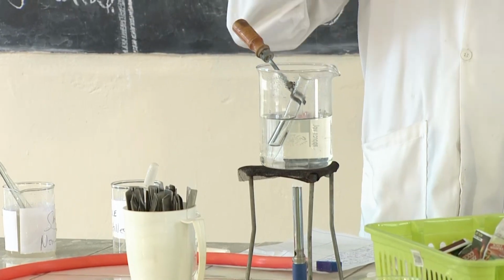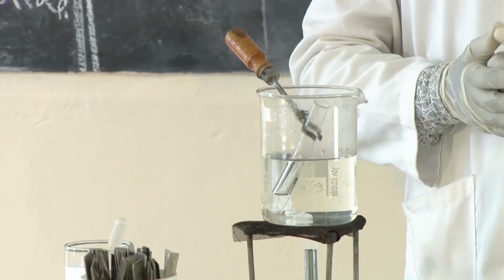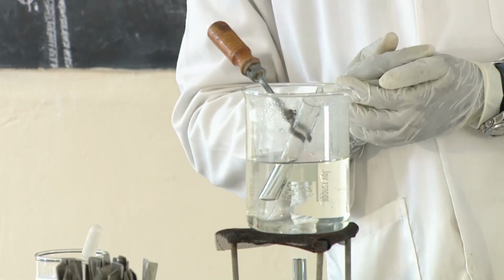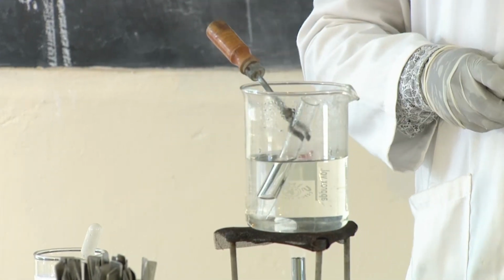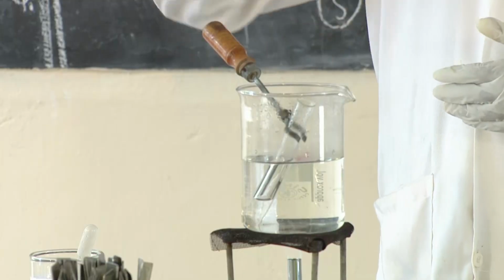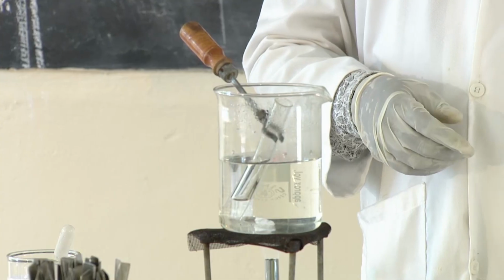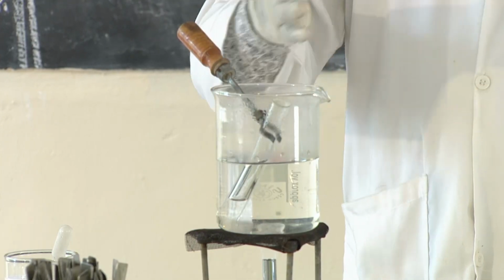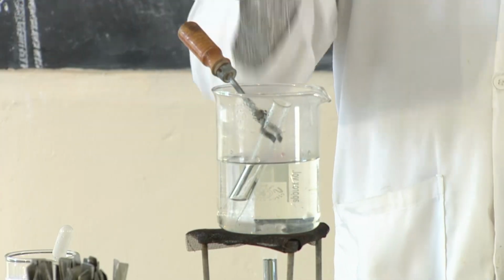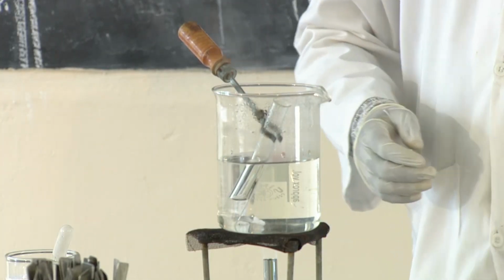We are preparing the sucrose to test if the solution contains non-reducing sugars, with sucrose as an example. When you heat, after heating, you cool the solution. After cooling the solution, you add the Benedict solution. And then finally, you heat it again. So observe the process. I'm now in the process of heating sucrose. I have added hydrochloric acid. Observe properly, and then we see the color changing.